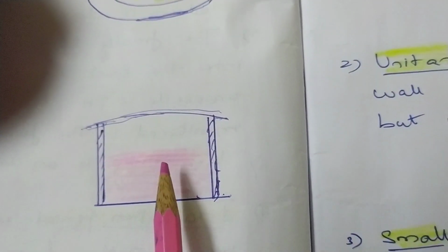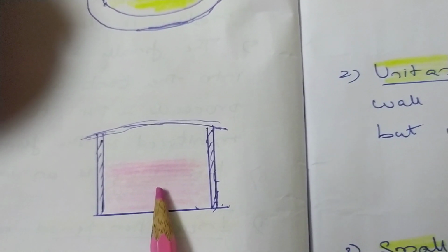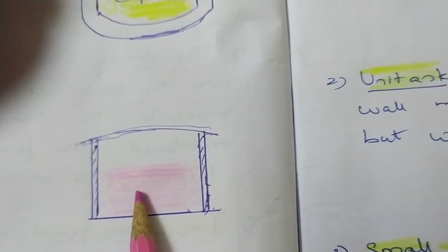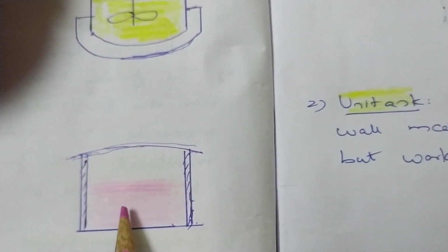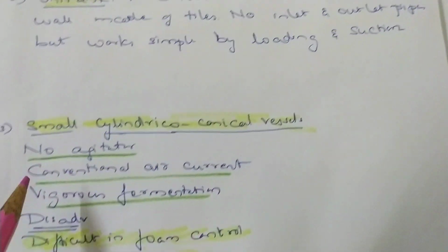It cannot be consumed, in the sense that the alcohol you can produce from molasses here can be used by the distillation process, not for consumption, not wine, etc. That's a basic unit tank.